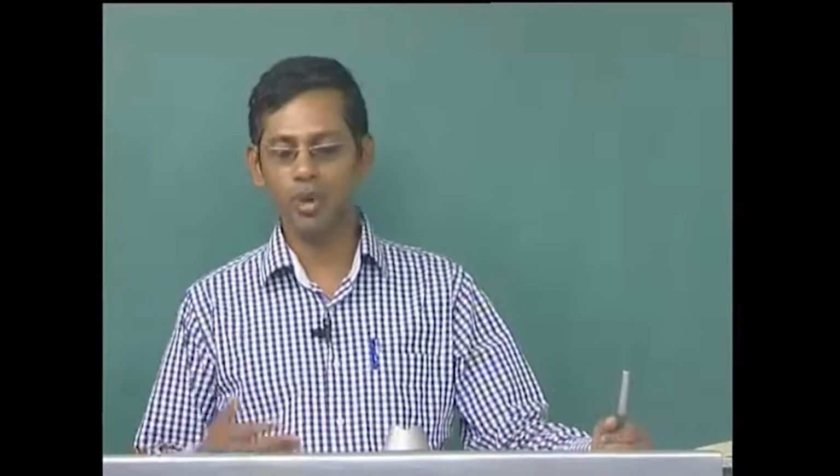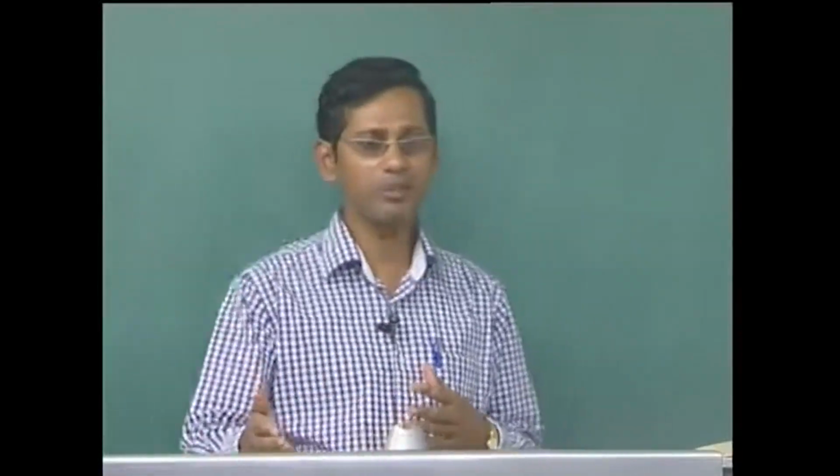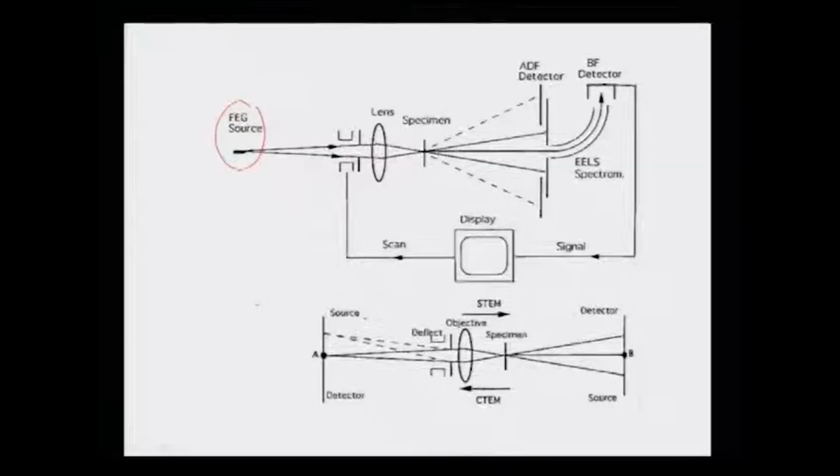As the beam scans on the sample, either the diffracted or the transmitted beam can be taken by the detector, and then plotted on the computer to obtain an image. So, the first thing to understand is that the intensities of the diffracted beams or the transmitted beam passing through the sample totally depend on the initial intensity of the convergent beam which is falling on the specimen.